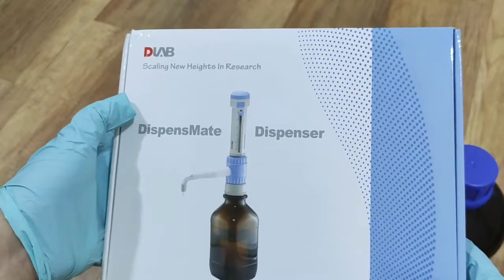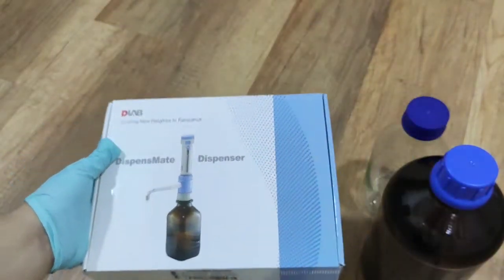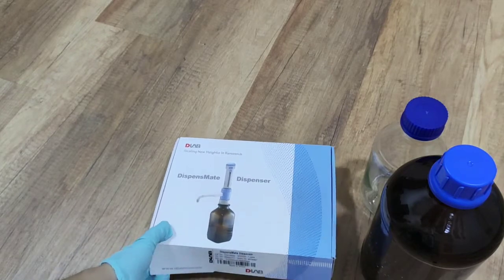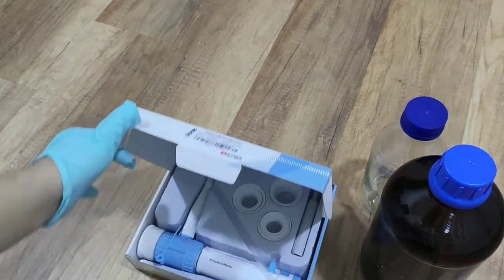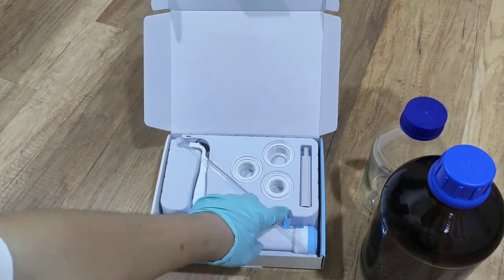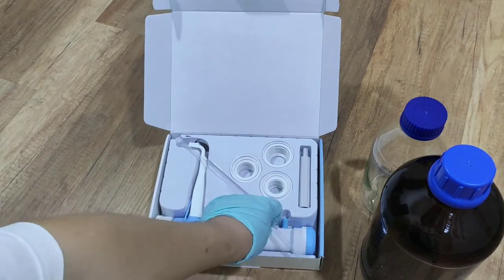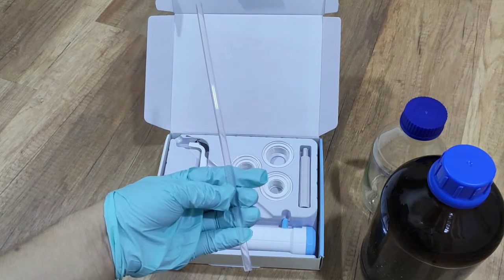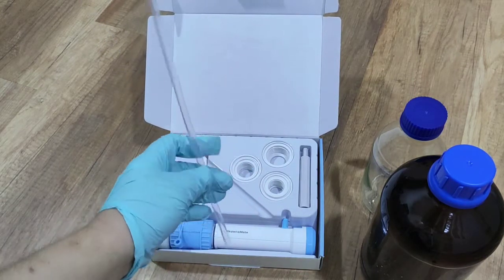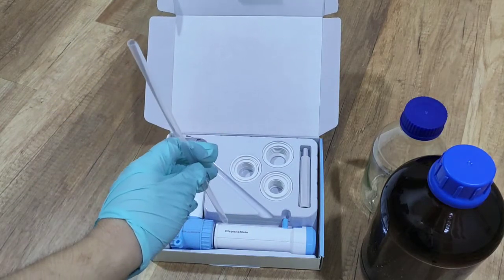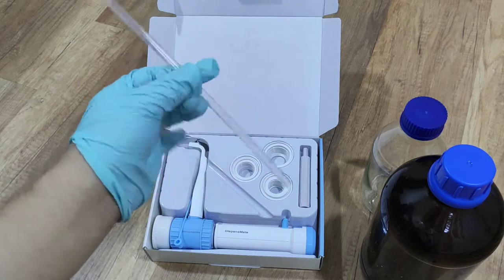So let me show you what's inside of this box. These are the pipes. The pipes connect from the dispenser and reach to the bottle. This is the pipe.